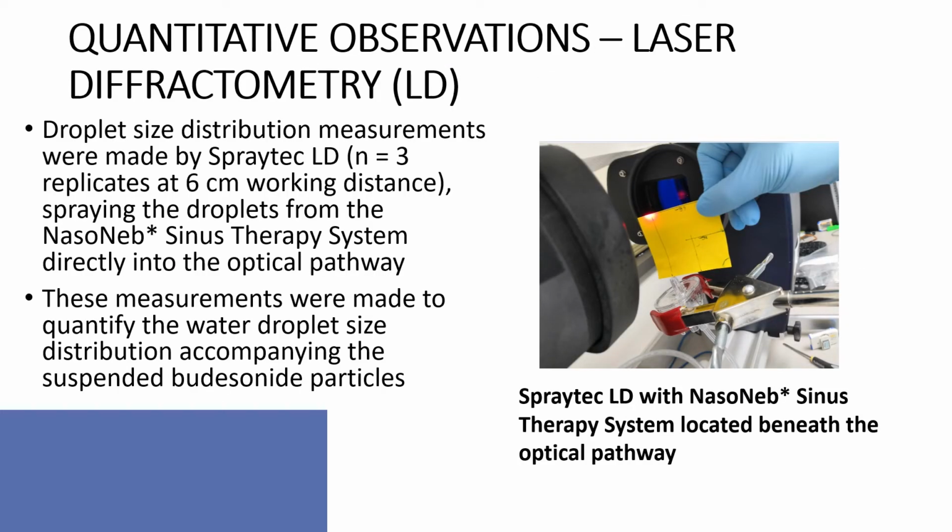Laser diffractometry provided a non-invasive way to quantify the water droplet size distribution emitted by the nasal nebulizer. This distribution is more important than the underlying size distribution of the budesonide particles in the nebulized suspension, as the water droplets convey the budesonide particles to where they deposit in the nasal cavity. In this particular instance, droplet size distributions were made by the SprayTech laser diffractometer at a 6 centimeter working distance.